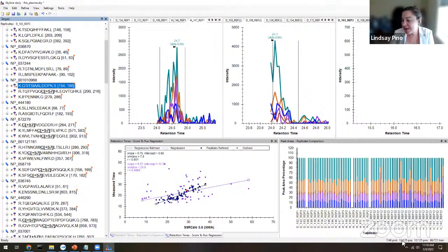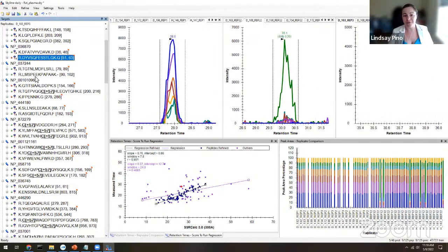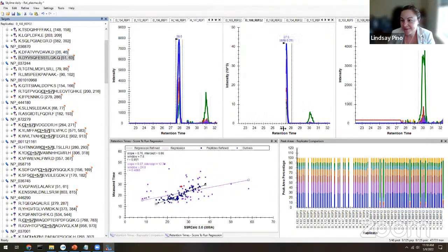In this document, we only have 125 peptides. So that's reasonable to spend, you know, an afternoon with a beer, going through your Skyline project and curating your data, looking for all of these issues with the data. For example, this mispicked peak right here on peptide DYVSQ. This peptide, it's clear in this file that the right peak was not selected. It's another one of these truncated.